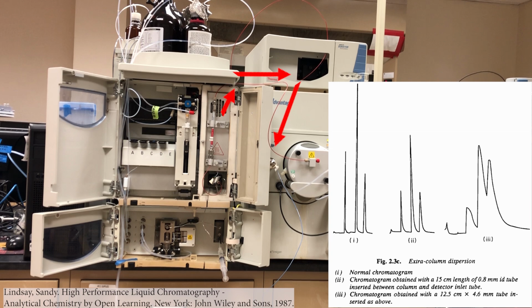You want to keep that as short as you can. It's a really small inner diameter tubing. But the more volume you have between your column and your detector, that's called dead volume. It's not doing anything for you. The separation is done, so all that's happening in that volume is band broadening. And you can see in this figure here, that's called extra column dispersion.